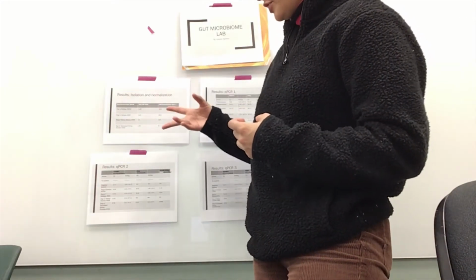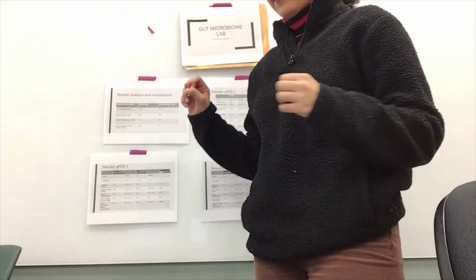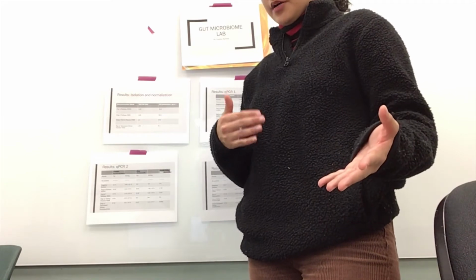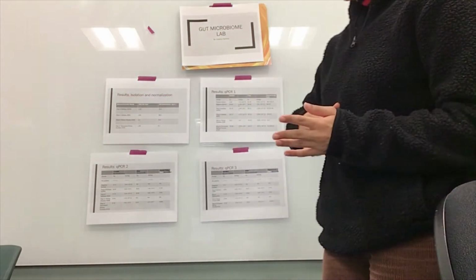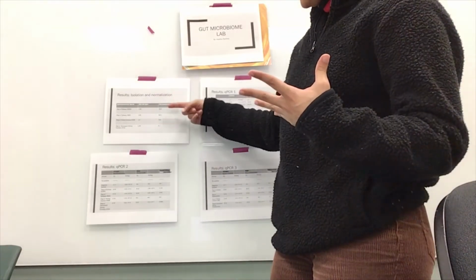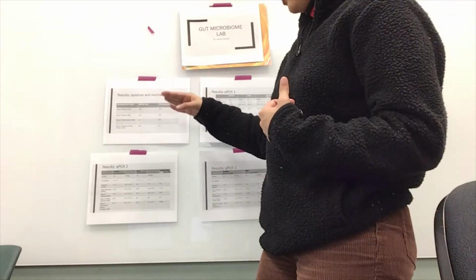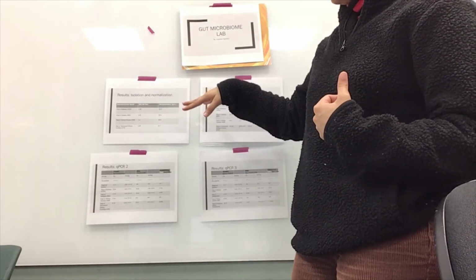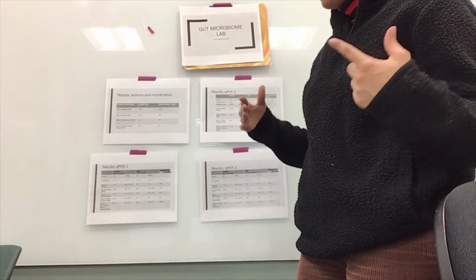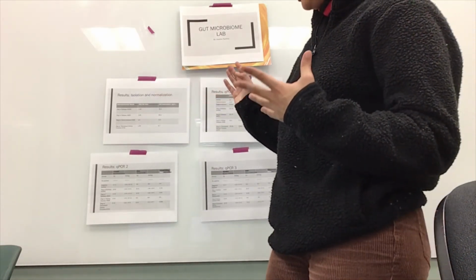And then our next two samples were the two dogs with the kidney disease. One was 1.4, one was 1.5, which did have some protein contamination since it was less than 1.8. And then our DNA concentrations were relatively high, except for one dog with epilepsy and one dog with decreased kidney function. The dog with epilepsy, sample 855, did have a high concentration of DNA present, which was 58.5. And then our lowest concentration was with the dog with decreased kidney function, which was at a concentration of 1.7.